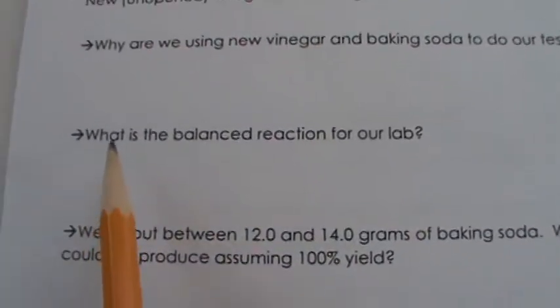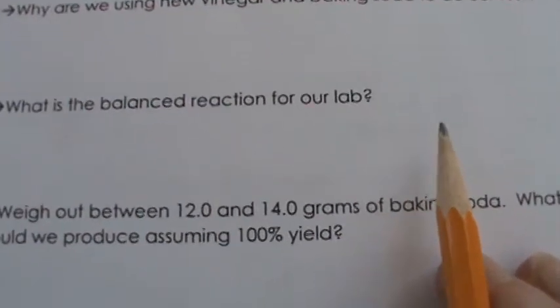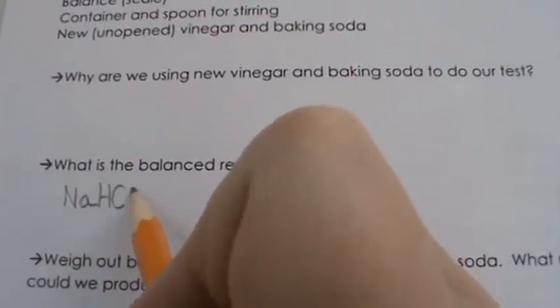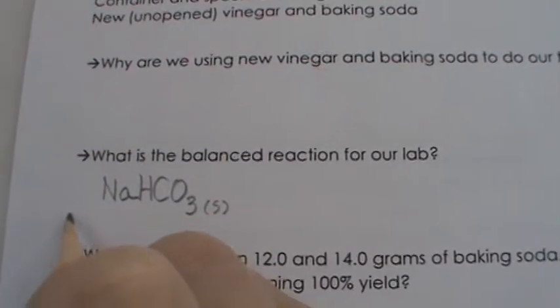Okay, now the next part here is what is the balanced reaction for our lab? Well, we're looking at baking soda, which is our sodium bicarbonate, NaHCO3 solid, okay, and this is our baking soda.